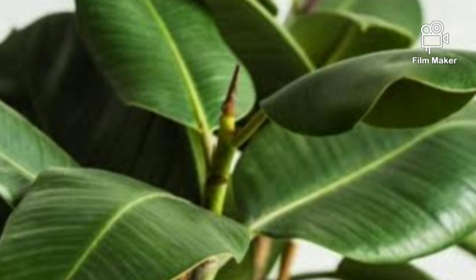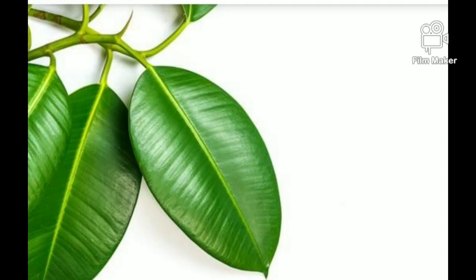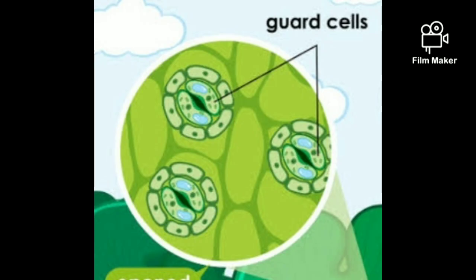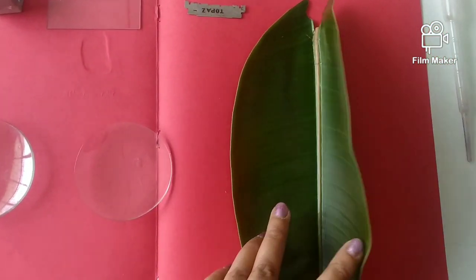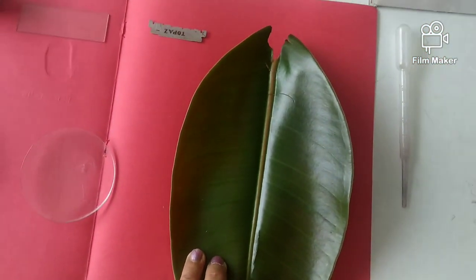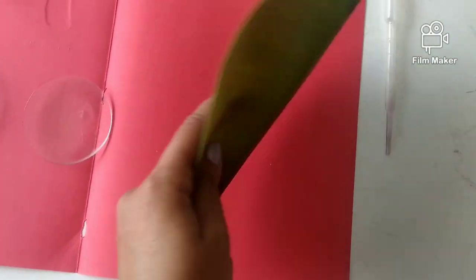Hello guys, I am here with a new video. This is an activity where we will observe stomata present in the leaf of rubber plant. It's very interesting to see more than a hundred stomata in a small piece of the epidermis of the leaf. Let's prepare the slide of leaf peel and then we will observe it under the microscope.